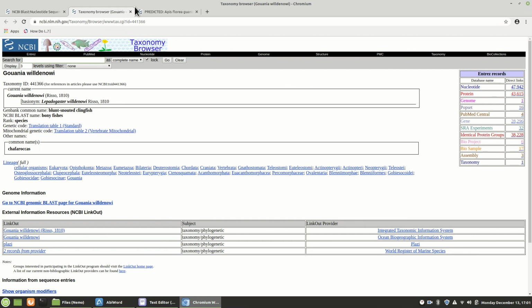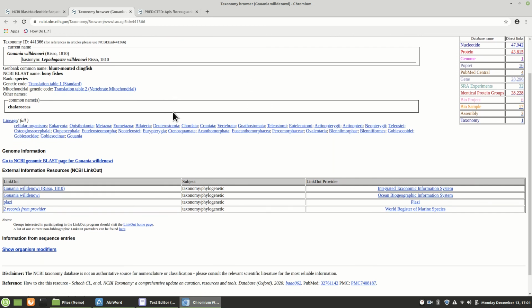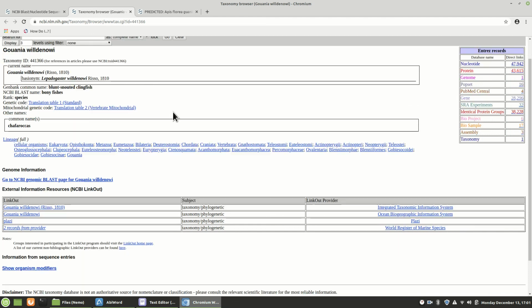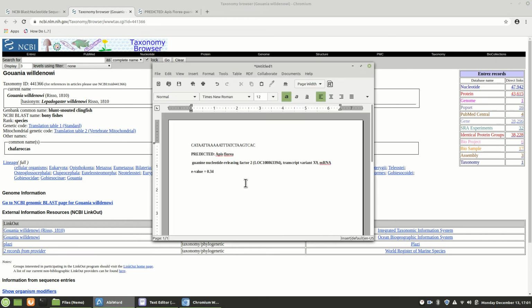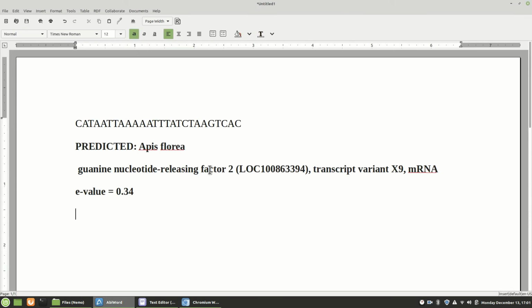Okay. Well, report that, as I showed. This will be how you can do this. I have a feeling this isn't going to be very useful, but it's your assignment, learning to use BLAST. So, if you have problems, email me. And nothing is something in this. Make sure you do something like this in your report.